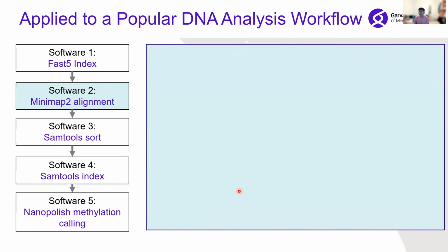This kind of analysis and optimization I first applied to a popular analysis workflow called methylation calling. I won't go into much detail. It is made up of 5 pieces of software. I'll focus on the two major bottlenecks.